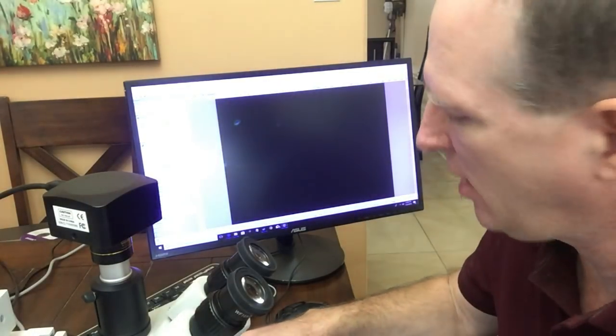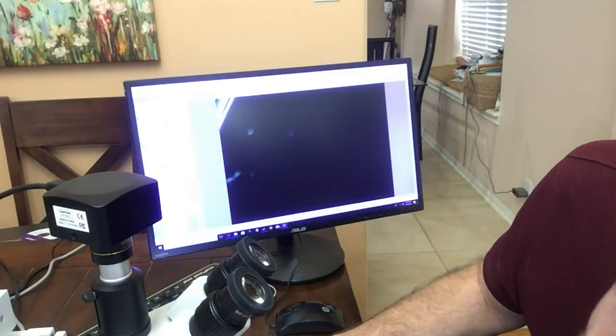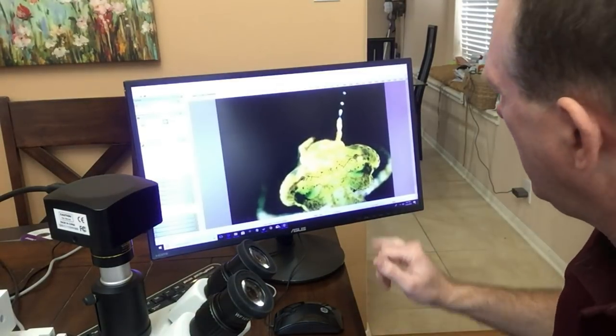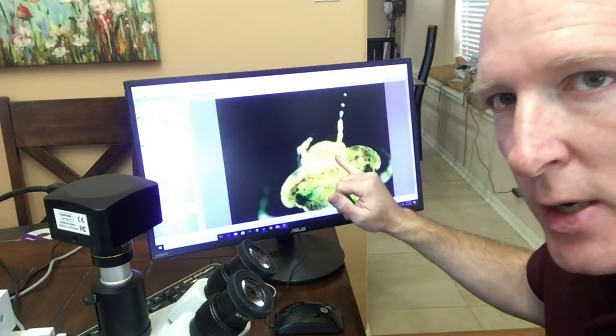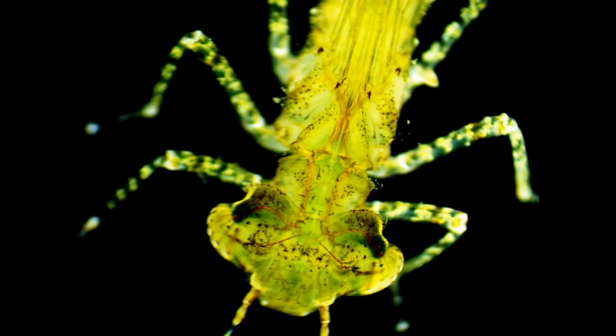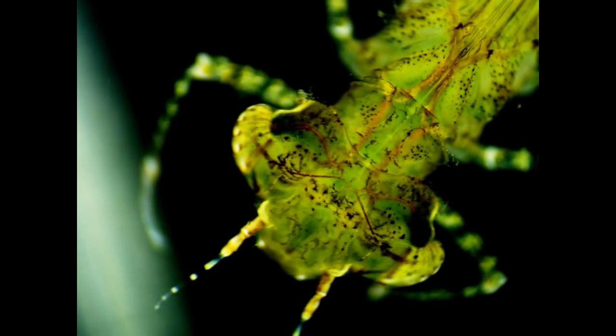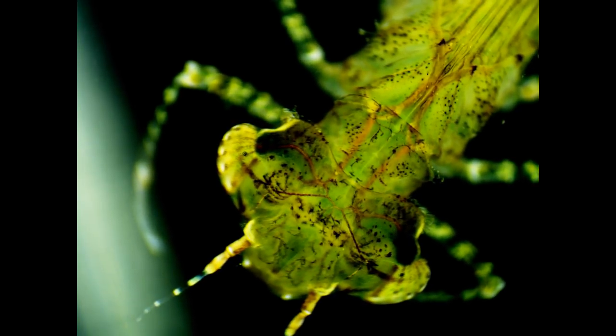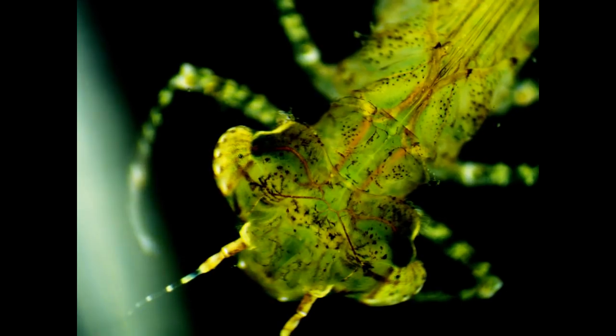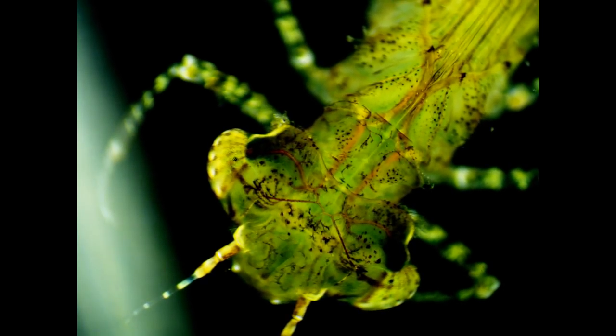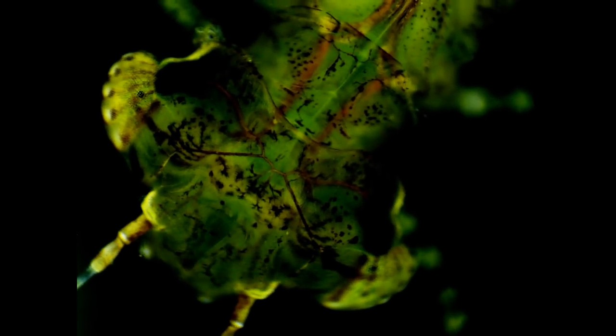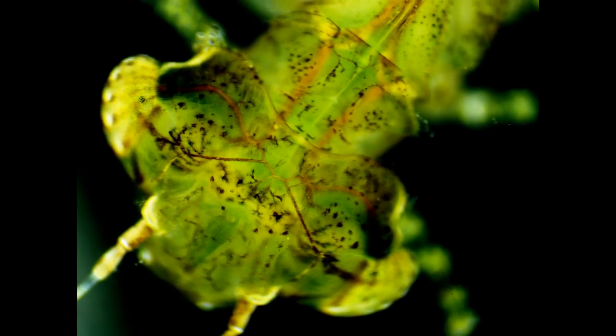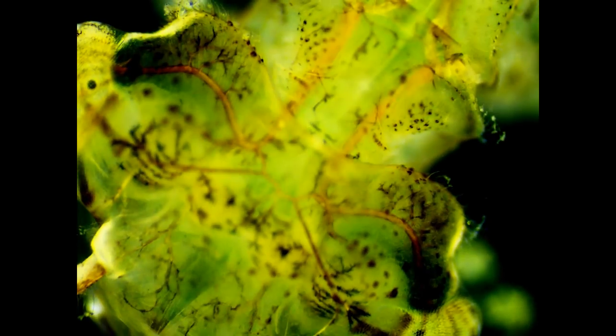Look at that. So you can see it's moving its mandibles right now, and you can see how these areas here look like they might be connected on the bottom part of the mandible. Maybe they're the muscles or however, and so they'll move at the same time. That almost looks like he's trying to eat. So what I've read is that they actually can eat algae. They'll eat algae or small protozoa, items like that.